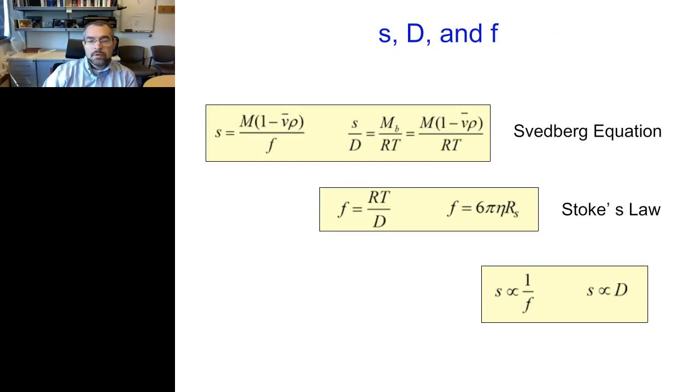All right, there will be a handful of you who love equations, probably many more of you who do not particularly care for equations, so I've tried to go pretty light in terms of all the math. But I want to show a few of these important and famous equations to illustrate some of the important underlying principles. I'm skipping over the Lamm equation, which is perhaps the most important one, because that actually describes the process of sedimentation, and I'll allude to that briefly later on. But these are some very important ones.